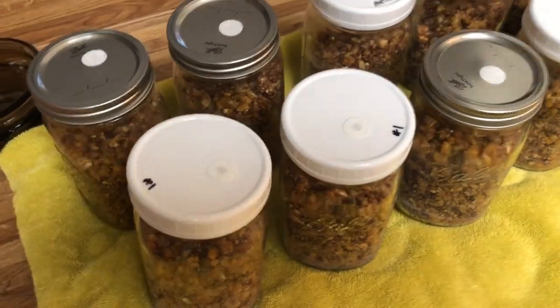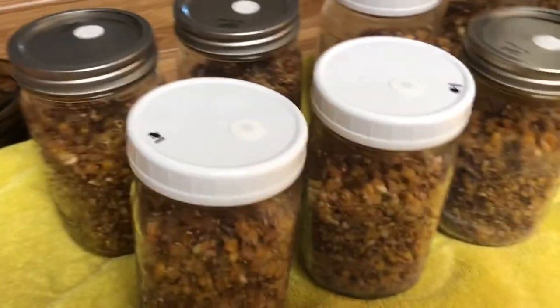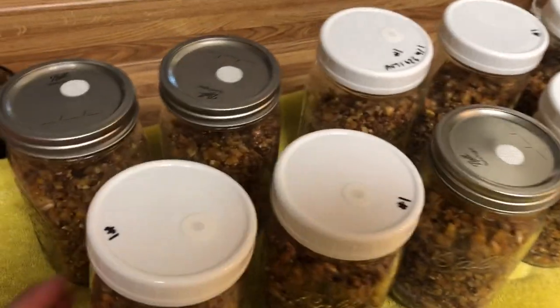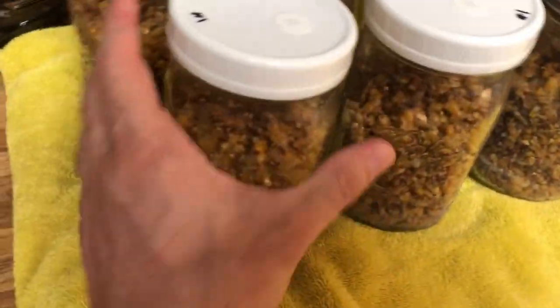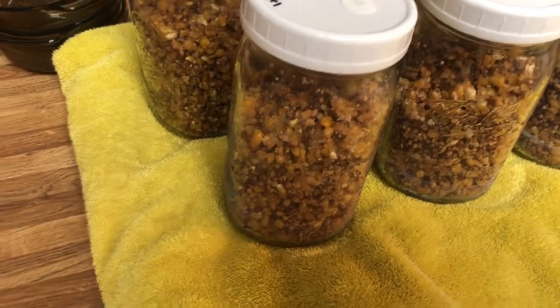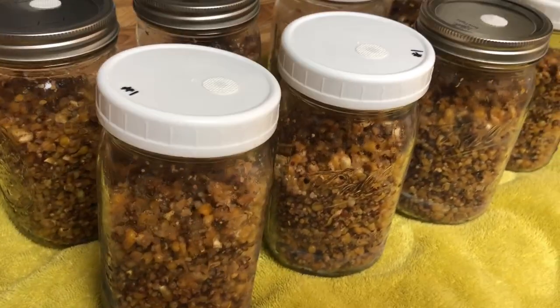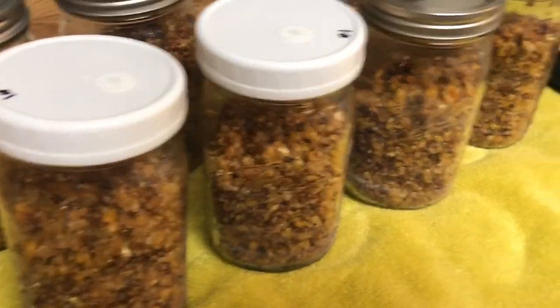So now I let these sit for 24 hours and then I inoculate them. You just need to make sure they're cool enough for the mycelium. And even though if you only waited a few hours, this might be cool to the touch, the grains could still be too hot inside. So I just let them sit 24 hours, do them the next day, never had a problem. I've waited a week and it's been fine.